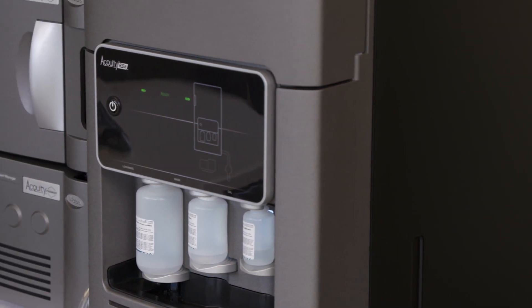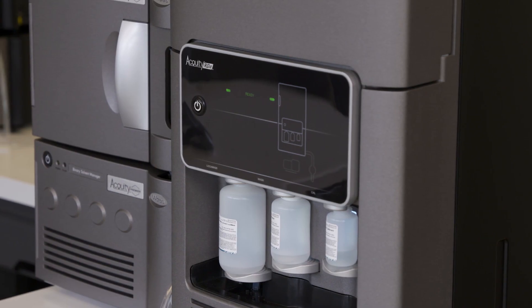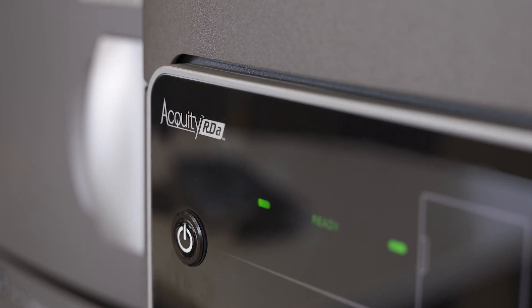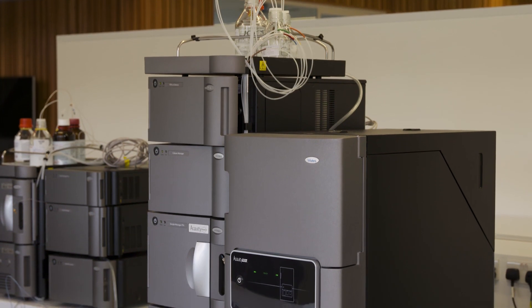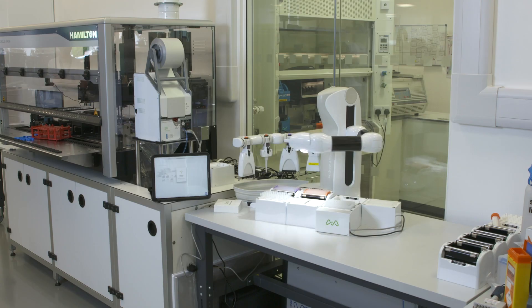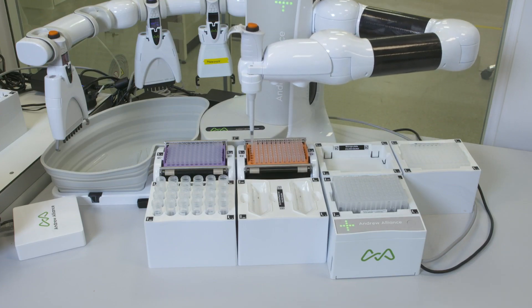The Acuity RDA detector provides routine access to accurate mass measurements for targeted and non-targeted forced degradation studies for a wide range of mass spectrometry expertise. Automatic identification and visualization of degradants and fragment ions is easily achievable without the need for manual interpretation. Visualization of potential structural fragment ion detection aids in pathway profiling studies. Streamlined workflows within UniFi allow for a stepwise investigation of the data, allowing quick appraisal of degradants produced to detailed profiling of degradants over time. The Waters Connect platform allows for a fully 21 CFR Part 11 compliant end-to-end workflow creation for routine analysis of forced degradation studies. With the Acuity RDA detector, high resolution mass spectrometry becomes routine.